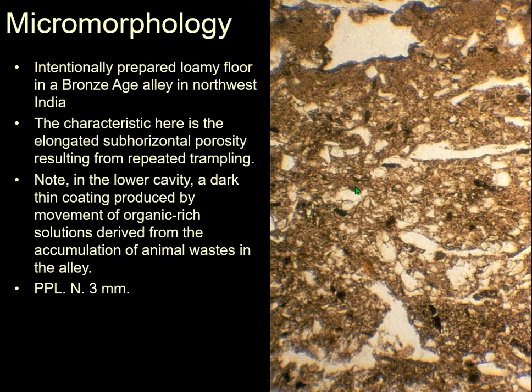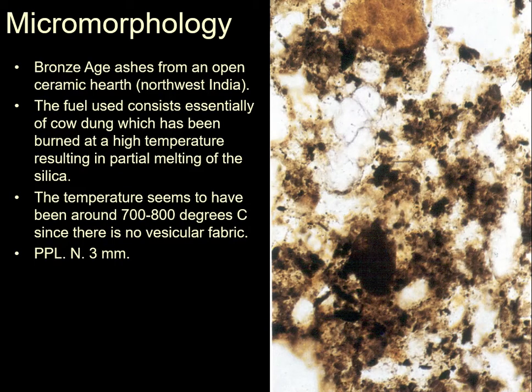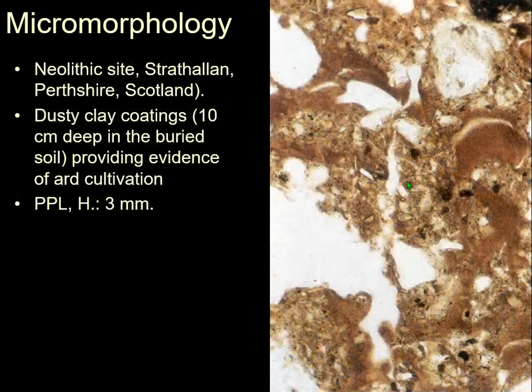Okay, this looks like another floor. Oh, animal waste. Okay, there's animal waste in this one. Okay, so they all have... Yes, the fuel is using cow dung. Okay, let's move along. Is there anything in here? Okay.